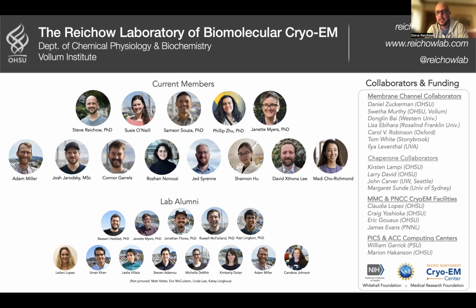So low affinity and low specificity leads to heterogeneity, right? And that's always a limitation in structural biology. And the beautiful thing with cryo-EM is its capability to oftentimes be able to resolve some of that heterogeneity, but you can't always do it. So that's kind of where we're struggling with doing small molecule stuff with these channels.